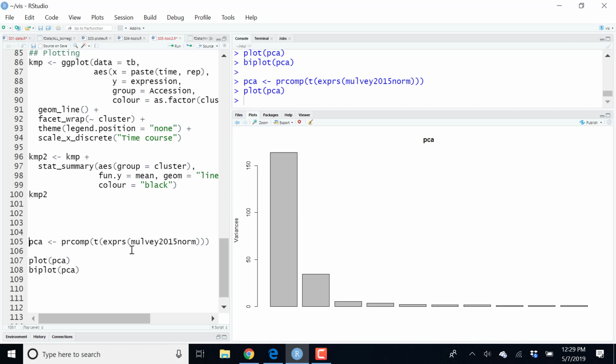Okay, and then I had 72 hours somewhere here, and then I had 0 and 6 somewhere here, and then probably 24, maybe 12, 4. Okay, so this is one application of my PCA plot where I want to have my columns in PCA space, but I might want to do something else.